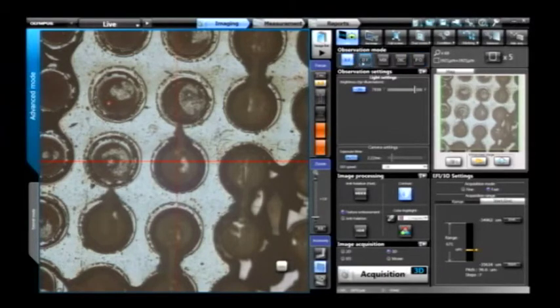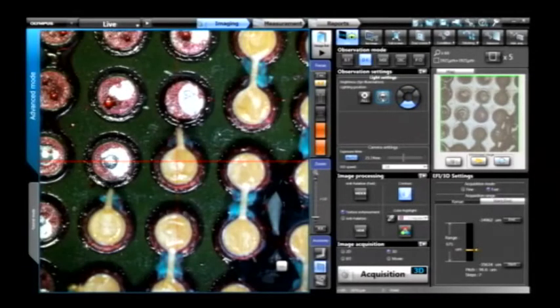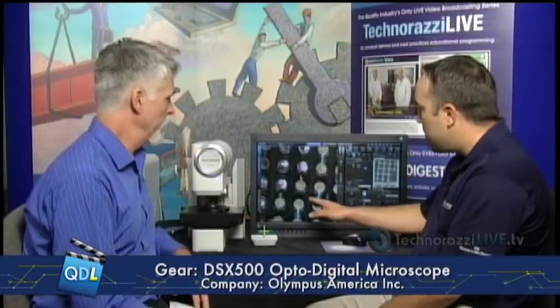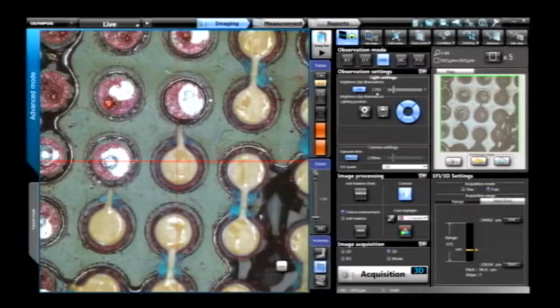On the image here we have bright field; we can switch to dark field and you can see the images come around. What's unique about this tool is the segmented LED dark field capability. This allows us to turn on different segments to light from different angles on your sample, and you can actually rotate those segments to see lighting from different angles, helping you choose what angle is best for imaging features or defects on the surface.